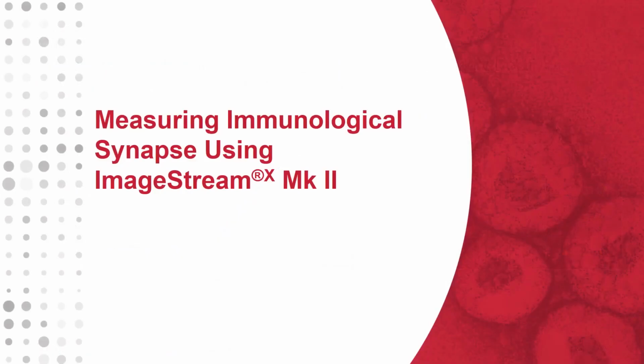So now I'm going to move to using the ImageStream to measure immunological synapse and investigate the recruitment of adhesion and signaling molecules to the immune synapse and measure the translocation of NF-kappa B and T cell APC conjugates.